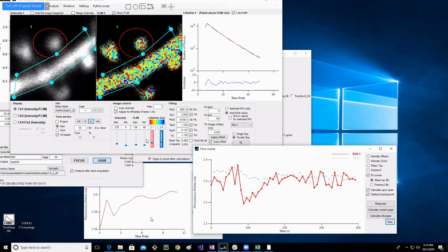If your baseline is heading down like this when you start your manipulation, it's really hard to know if your manipulation had any real effect. So one of the most important things, and usually hard for people starting out imaging, is getting a pretty flat baseline. You can see that my baseline is pretty noisy here. It's bouncing up and down, but it doesn't have any real trajectory, right? It's not heading all the way up or all the way down. So you want something fairly stable.